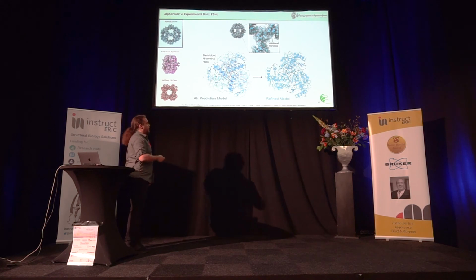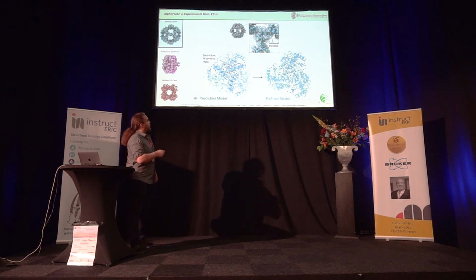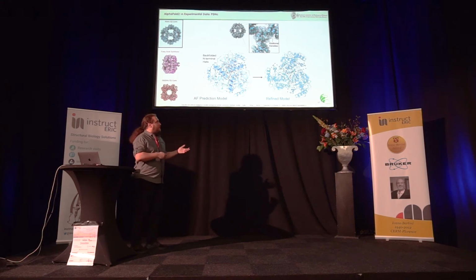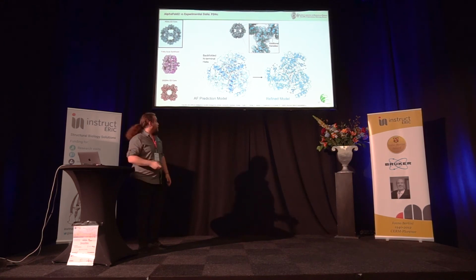But in our experimental data, these helices are missing. We see that these helices are blocking the accessibility to the CoA binding domain. Hence, AlphaFold predicts an inactive state of the complex, whereas we have verified with our activity assays that in our fraction, our complex is active.